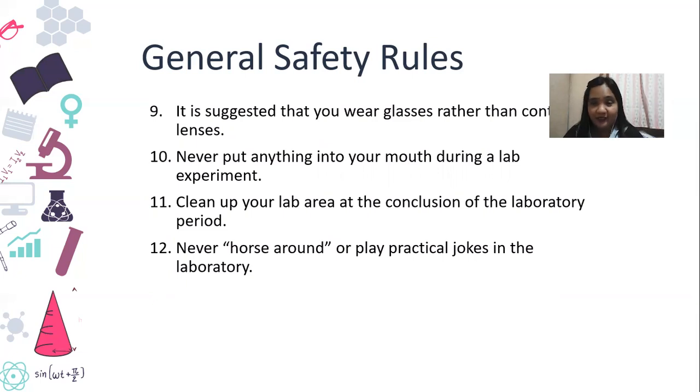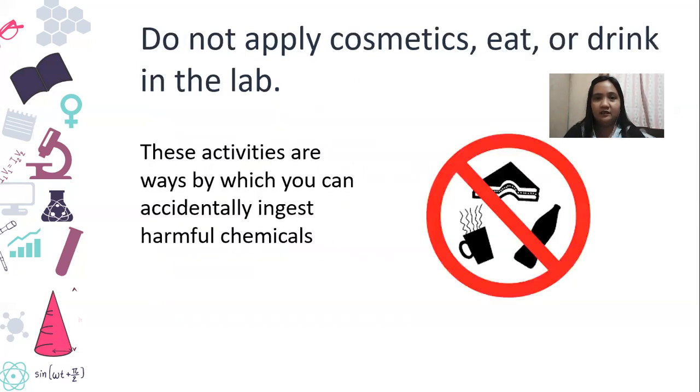And then clean up your lab area at the conclusion of the laboratory period. Of course, clean as you go, or "clay go," as we call it. Whatever mess you create, please tidy up after the laboratory period. And of course, this is very important. You guys are adults. Never horse around or play practical jokes in the laboratory. It's called horseplay. So you guys, I believe you are young ladies and young gentlemen already. So please avoid playing around so as to also prevent small accidents.